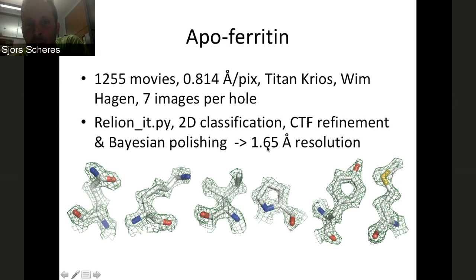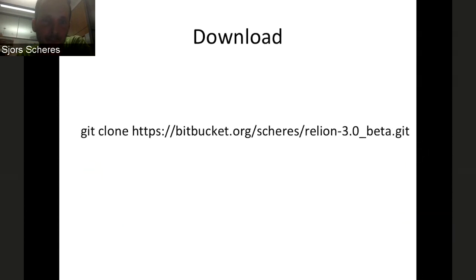So this is very close to 2 times this number. I think we're only 2 or 3 shells away from the Nyquist frequency. I do think this resolution estimate is true, though. We see beautiful rings in prolines. We can see even bigger blobs for sulfurs here, and overall, I think density looks pretty good, as you would expect for a 1.65 angstrom resolution map.